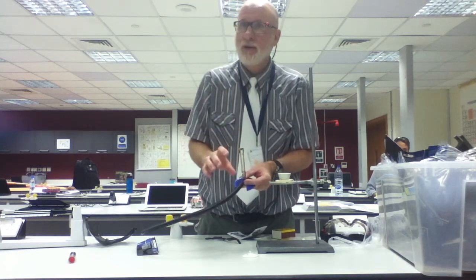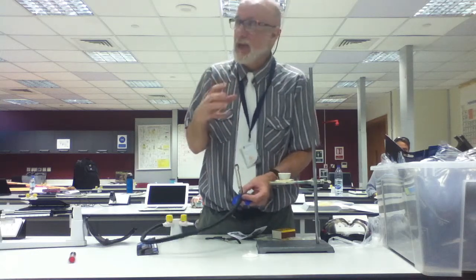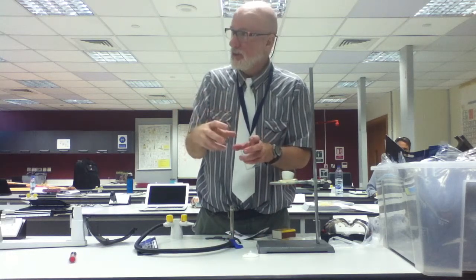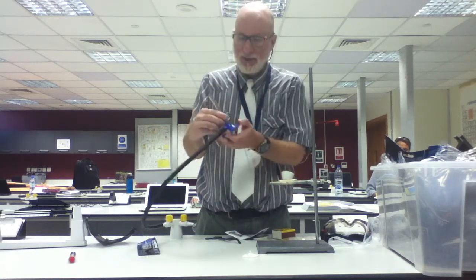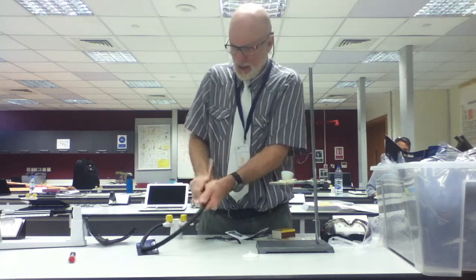The carburetor is a chamber that mixes the reactants in a car. They used to have carburetors in the old days. What it did was allow the gasoline, the petrol, to come in, and it mixed it with atmospheric oxygen in just the right measure so that it would burn. And that's kind of what this does. This allows the air to come in. Let me take this off here.